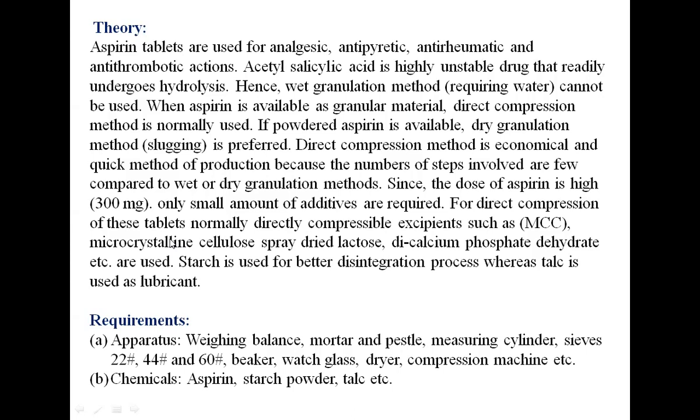For direct compression of these tablets, normally directly compressible excipients are used, such as microcrystalline cellulose, MCC being the abbreviated form, spray dried lactose, then dicalcium phosphate dihydrate. These are the chemicals that are used. Starch is used for better disintegration, whereas talc is used as a lubricant.